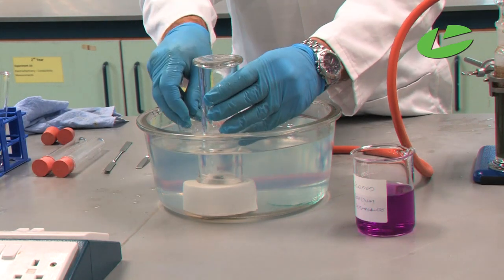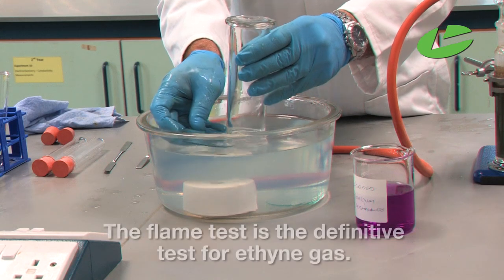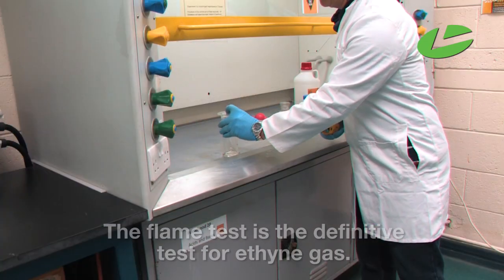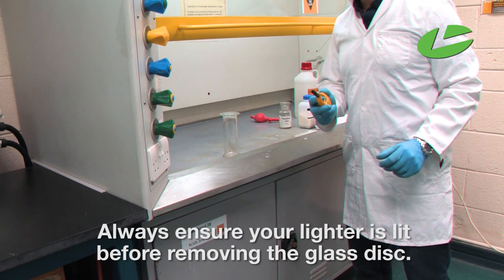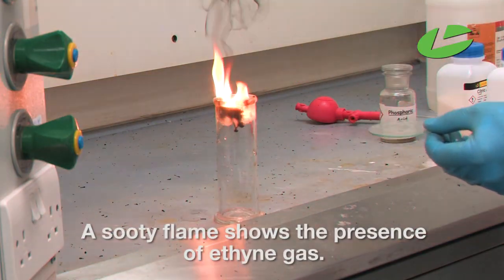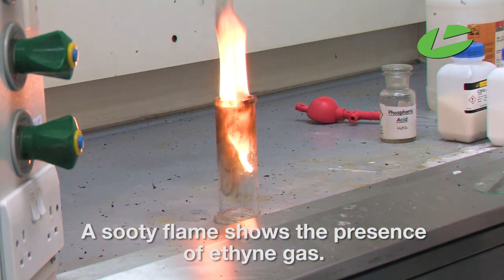Now I take out my gas jar — slip the glass disc underneath before lifting the jar out of the water. I've now got my sample of ethyne gas for the flame test. Put the glass jar into the fume cupboard. Always make sure your lighter is lit before you remove the glass disc. You can see the sooty flame — we have definitely produced ethyne gas.